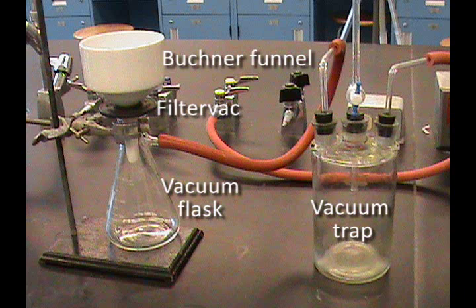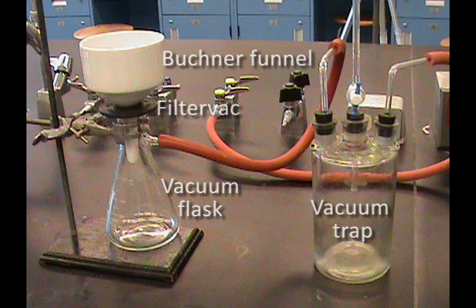A trap is used to prevent liquid from being sucked into the vacuum system. The washer ensures that a seal is made between the funnel and the flask.